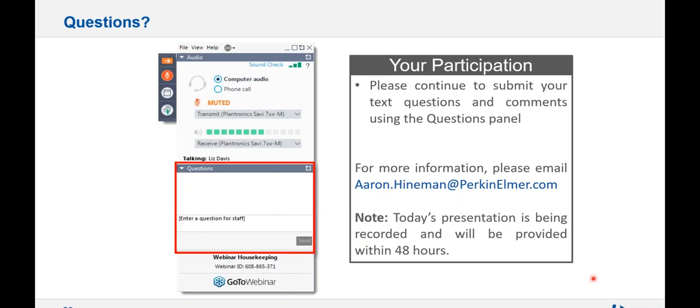We're on the top of the hour. Let's see if I can find a couple more. Someone asked, is there a part one? Yes, that was on flame maintenance. I got a few more questions here. What is the typical BOC time when you run with an EDL lamp?